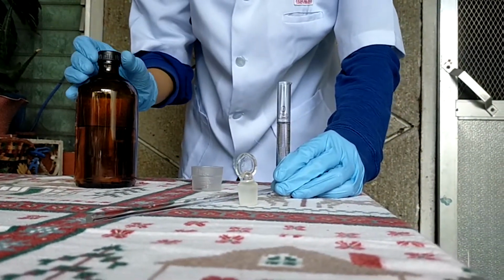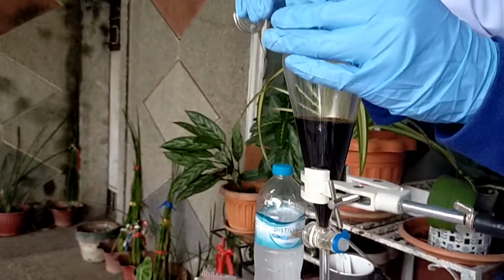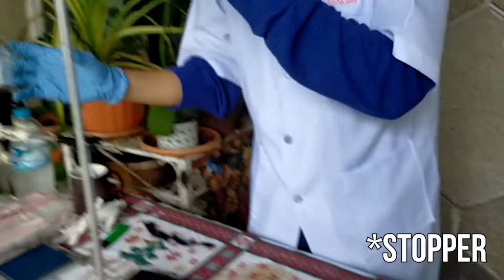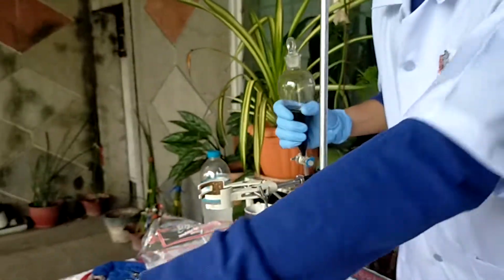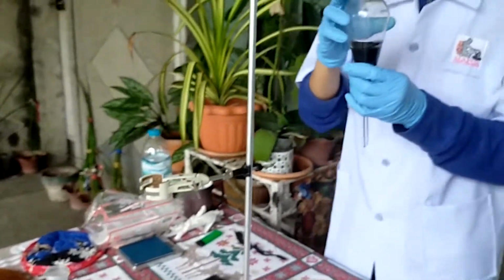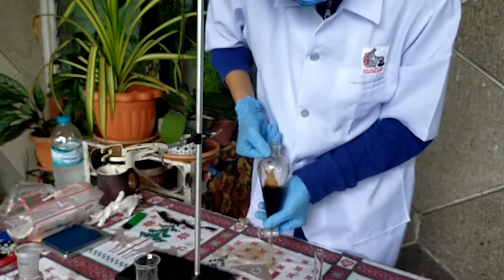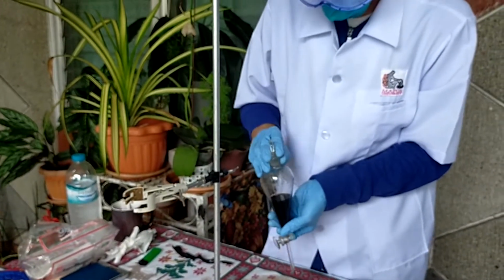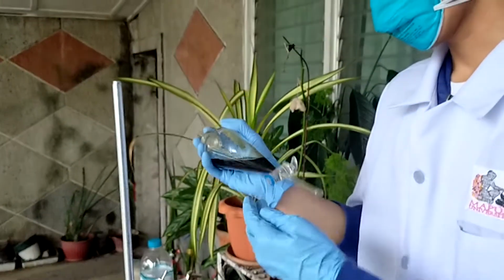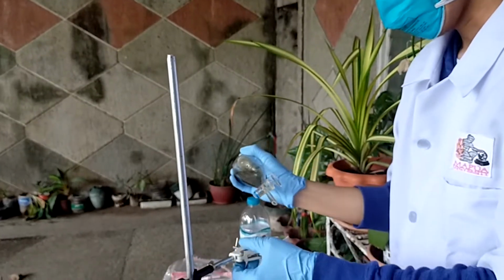I will now introduce it to our coffee. Here, slowly but surely introduce it. And now that I have introduced it, I will put now the stopcock. And now I will invert it. I'm going to let this be the one which catches the aqueous layer. Okay, I'm going to invert now the separatory funnel, making sure it's closed. So that's one inversion. One inversion, and then my second inversion. So then here, all the way from one. Nice.